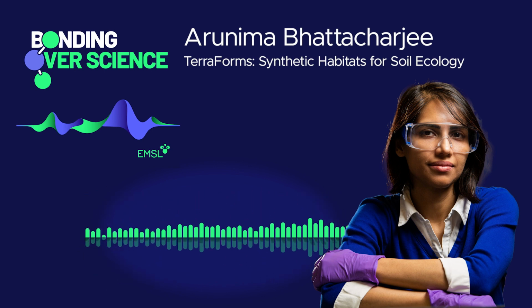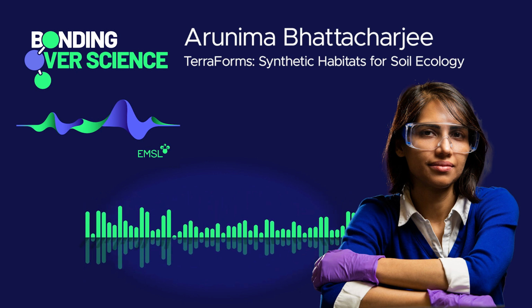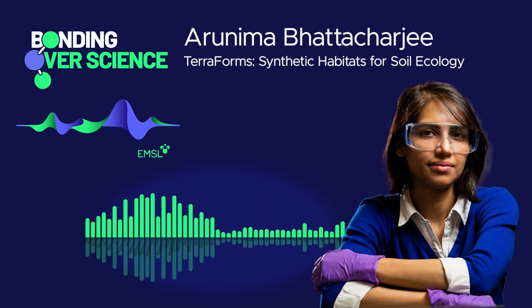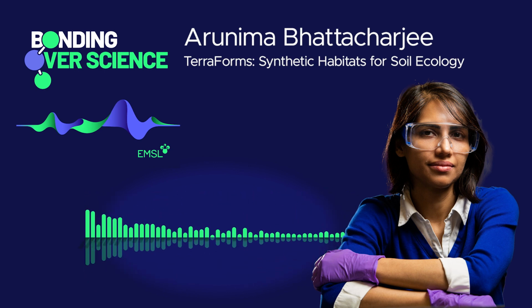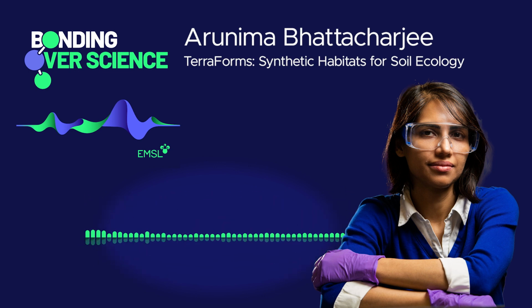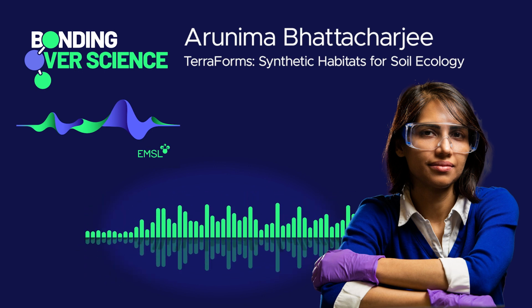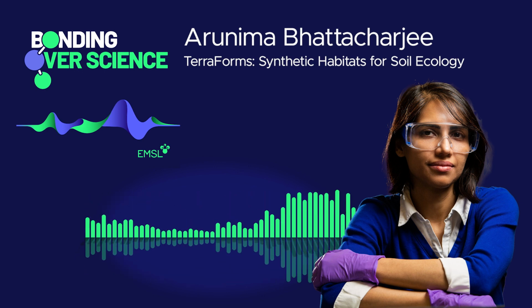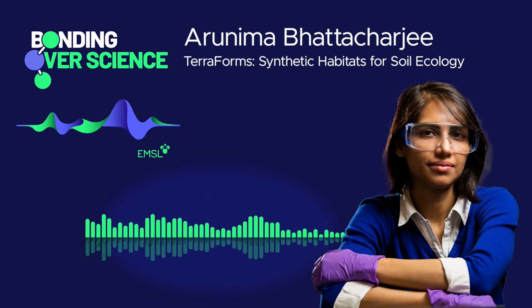So we wanted to develop something where we retain the heterogeneity, because the heterogeneity is super important. It is why we have this huge biodiversity of microbes, which we love to study. And so how can we retain this biodiversity and still be able to visualize them not only through optical imaging, just looking at them growing using a microscope, but also to get some chemical information spatially. What kind of metabolites they're making as they're growing around inside of soil pores, while they're interacting with each other, and while they're degrading minerals or degrading different carbon sources. So all this information is important because once we understand them, we can build better systems for different agricultural practices. And so that's basically my research.